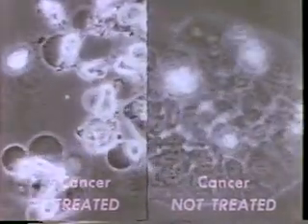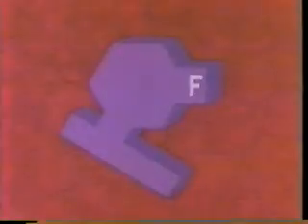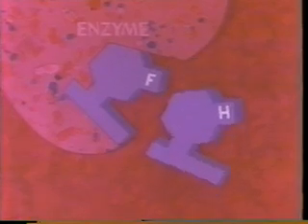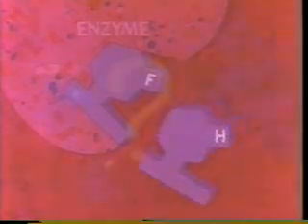But are we sure that the cancer growth is stopped in the manner we predicted? Instead of the 5-fluorouracil blocking the enzyme as we have suggested, and using this means to kill the cell, is it possible that the 5-fluorouracil is incorporated into the DNA, inhibiting its function? To determine where the 5-fluorouracil is acting, in the enzyme or the DNA, let's conduct an experiment on some human cancer cells grown in the laboratory.